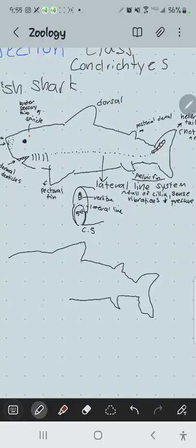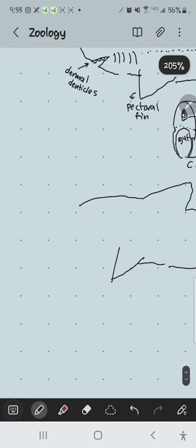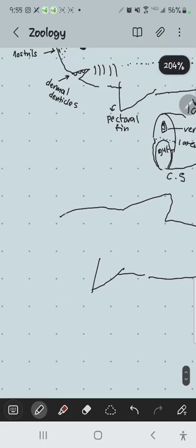Since COVID, I don't know what's going on, but I think what happened was all of the really good senior biotechnicians that would do this all retired. And now I don't think they really have skilled labor doing this. So in years past, sometimes the sharks are kind of blown up inside, like they've over-injected them and organs explode. So I don't know what we're gonna get.